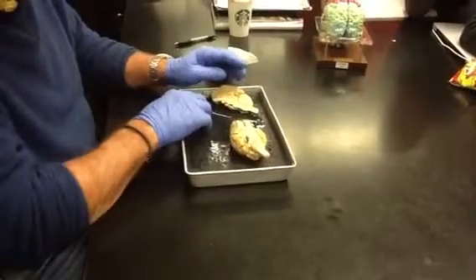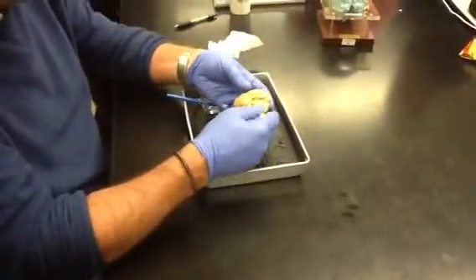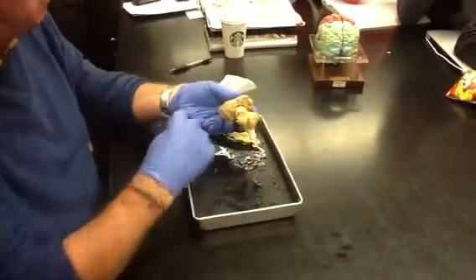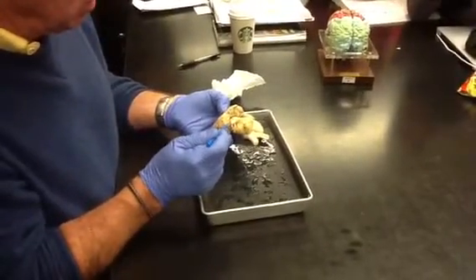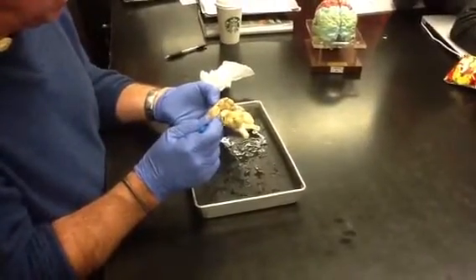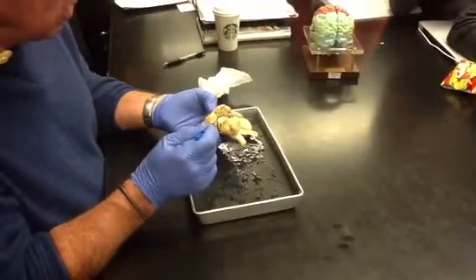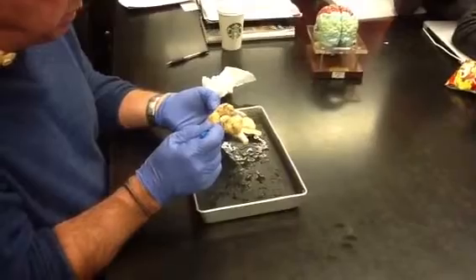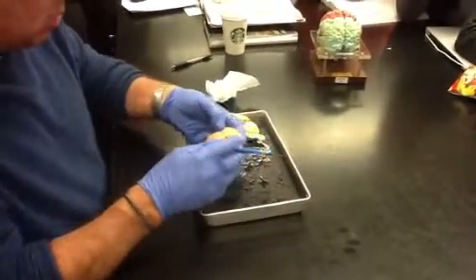And then that last thing I was telling you guys about, the corpora quadrigemina. If you take the brain like this and drop the cerebellum down, you can see right here in the back there's 1, 2, 3, 4 little structures. The whole structure is the corpora quadrigemina, and the two bigger lobes at the top are the superior colliculi, and the smaller ones below are the inferior colliculi. Right? So that's what this looks like in a whole structure.